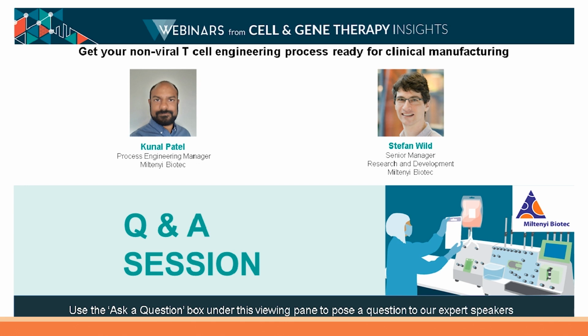And here, I think Electroporation is really opening the doors for CAR NKs and other gene-modified NK cell therapies, as well as the hematopoietic stem cell space. I think there's a lot of interest now in the HSC space to allow for modification of these cells for various regenerative medicine indications. So with those combinations, the Electroporation really is opening up the doors for a lot of opportunity that wasn't there previously.